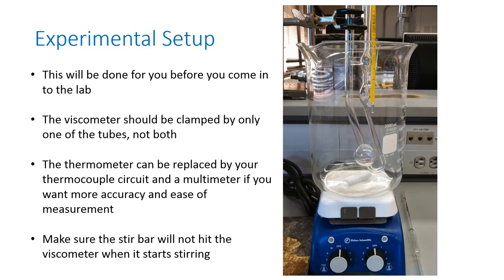Another thing to make sure of before you add the water is that the viscometer is clamped at such a height that the stir bar is not going to hit it when it starts stirring. The viscometer is a pretty fragile piece of glassware, and if you break it during the experiment, you're going to have to start all over because your calibration will only apply to that specific piece of glassware.